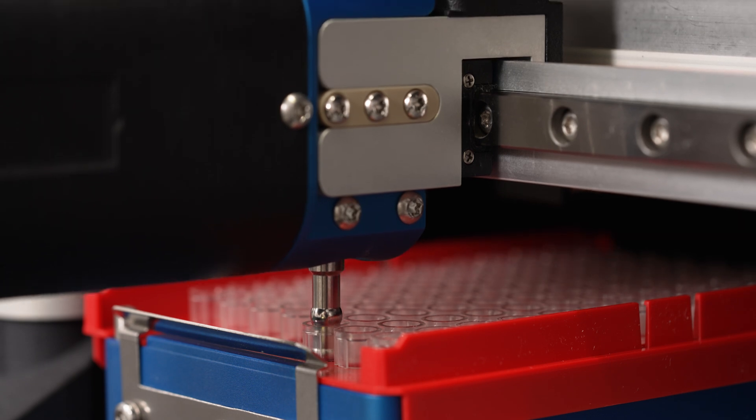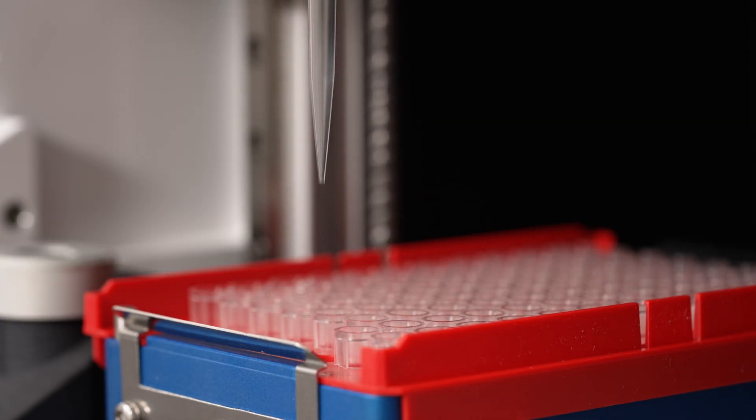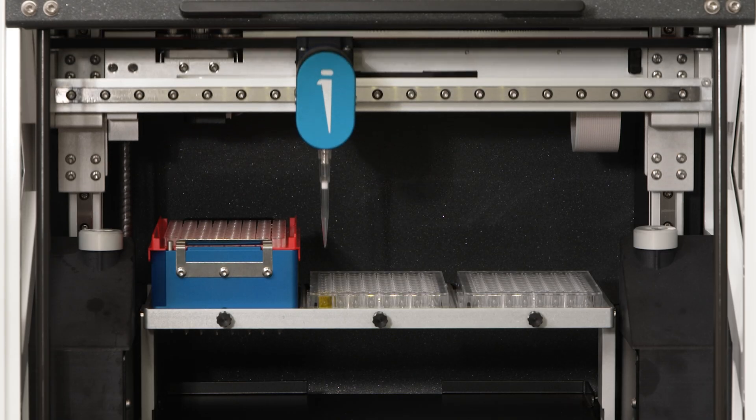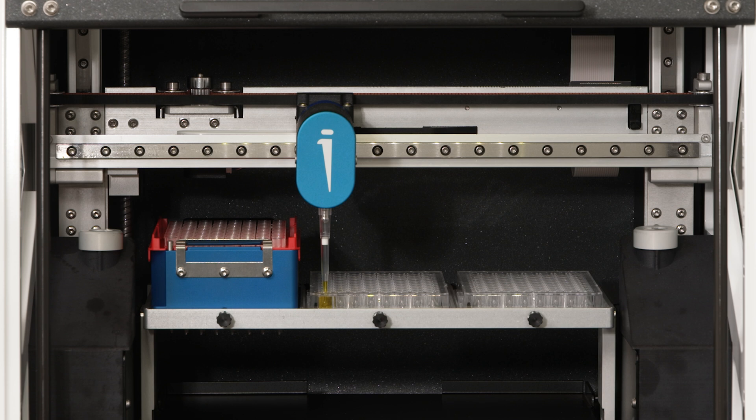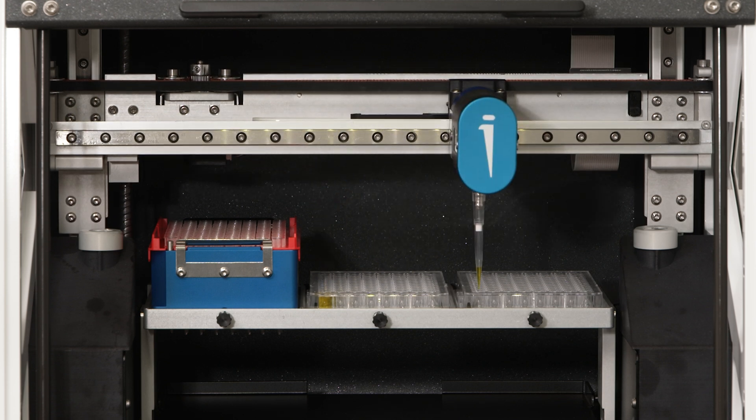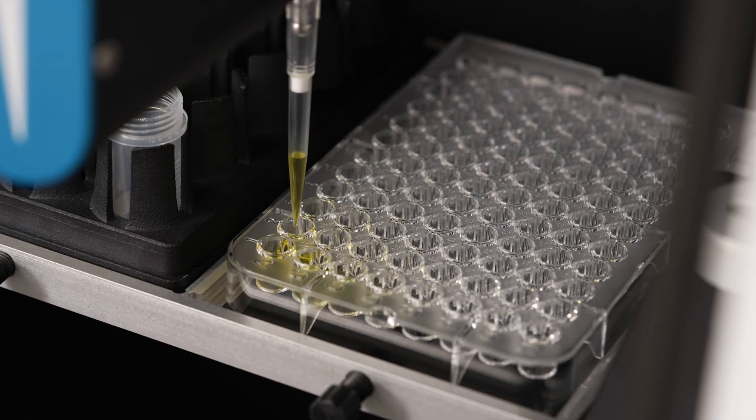iPrep uses intelligent tip detection so that if no tip is present, it will automatically seek to the next position. iPrep supports forward, reverse, and multi-dispense pipetting modes.